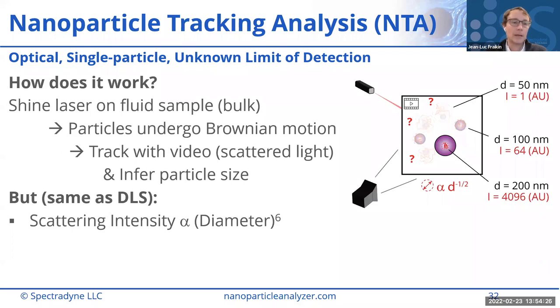I can tell you that cartridge development and the technologies required to scale down are a very active area for us right now. In the past, we have shown measurements down to 35 nanometers. Those cartridges were not commercially viable, but it definitely shows proof of principle. So that's an active area that we want to expand into.